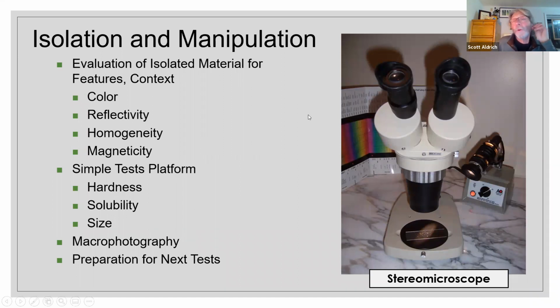So really the workhorse for any kind of forensic investigation becomes a stereo microscope. And I can see where you may use one in some practices, for pond water, for flower examination, for other materials that you'd like to observe from 1 to 10x. It might be a really helpful device. And you see an external incident illuminator revealing material on a microscope slide. You can tell there's quite a lot of room between the objective and the stage.